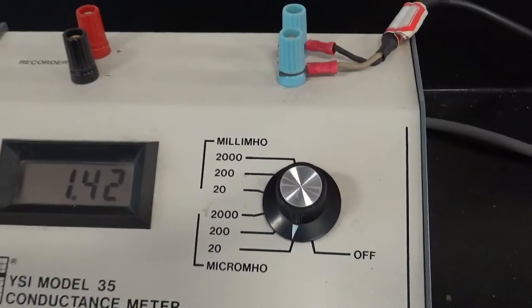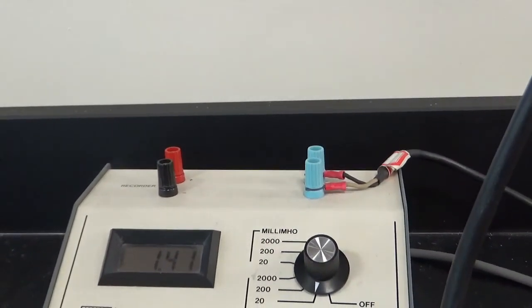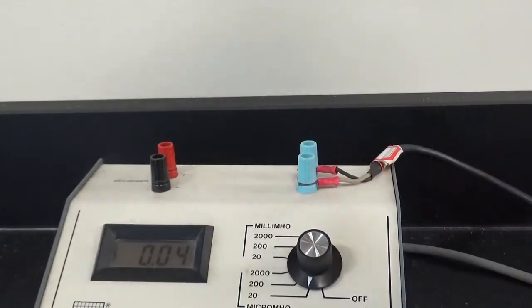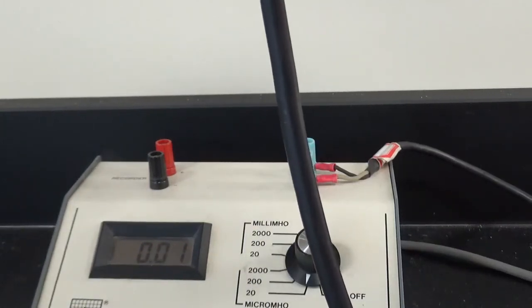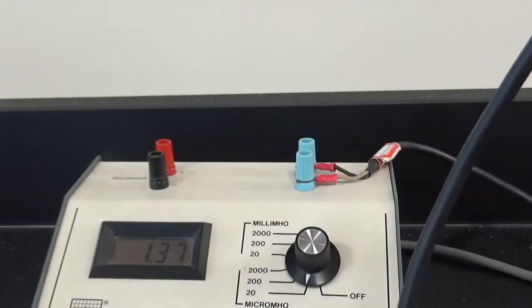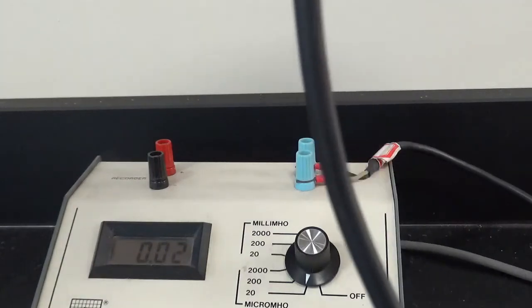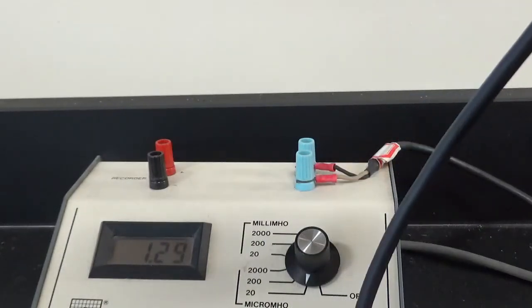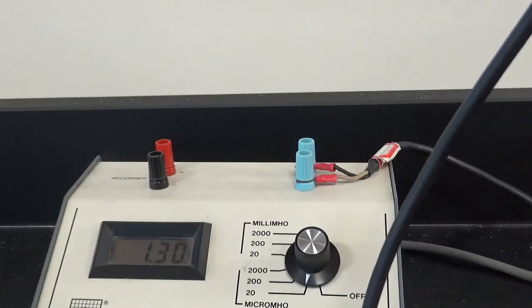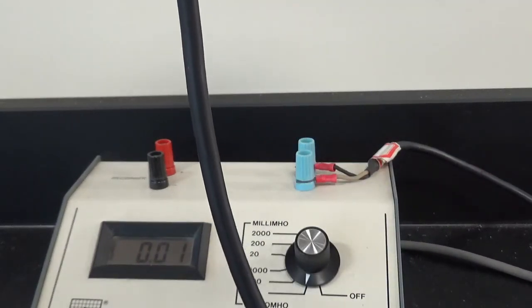Okay, so right now let's see if I've rinsed enough. Ouch. Let me rinse it one more time. I ran out of water in there. So let's see if it goes down anymore with another rinsing. 1.34, it's gone down a teeny bit. And I wish I could have one of you remind me to record the temperature, because conductivity really does depend on temperature. Okay. We're sort of approaching a minimum value.